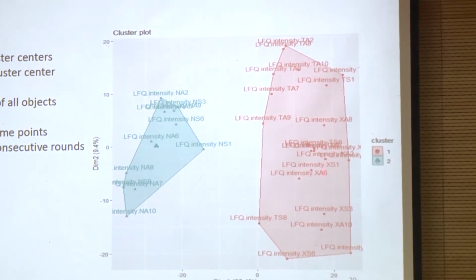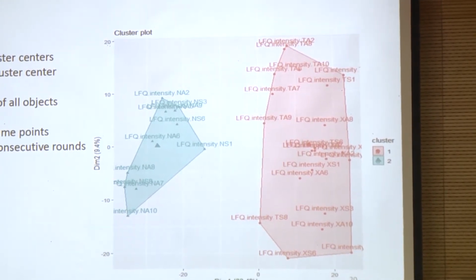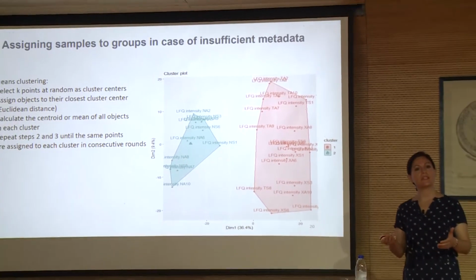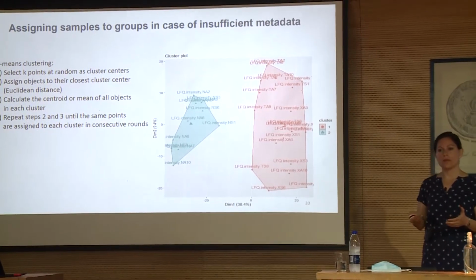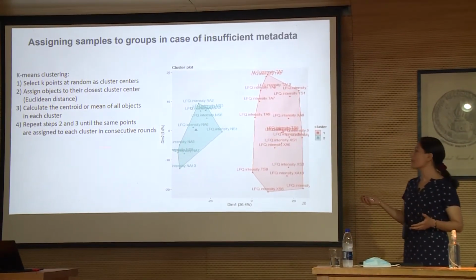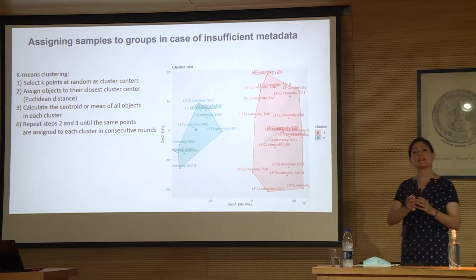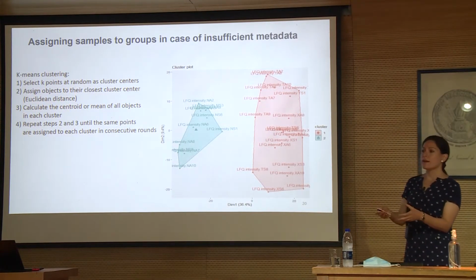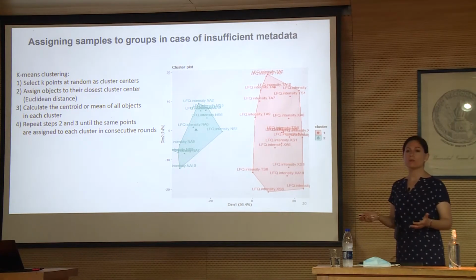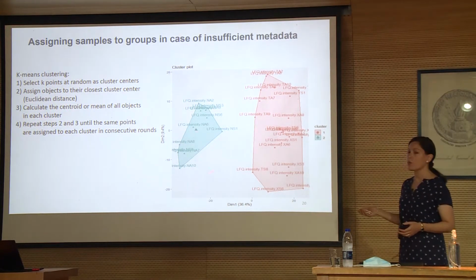But in this case, one of the treatments that we are evaluating actually does nothing, so it's very similar to the control. And that's what the workflow is going to consider: we have 1 treatment that really has an effect and another one that does not. So for the workflow, it will be like 1 control and 1 treatment.